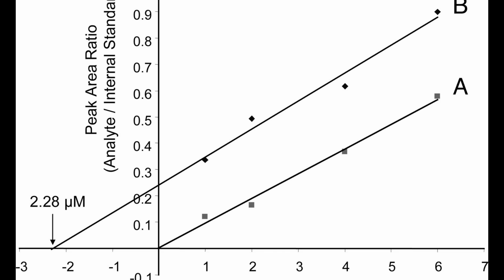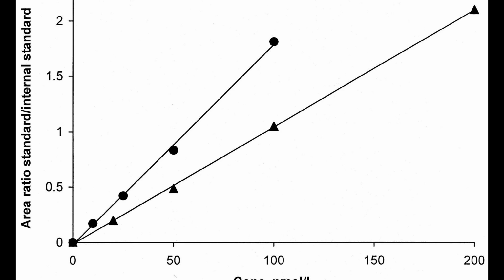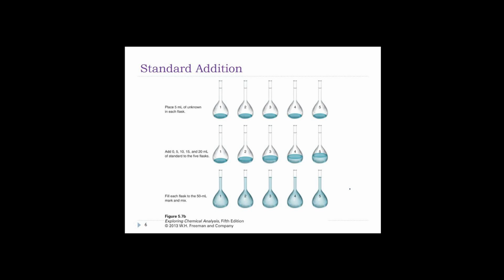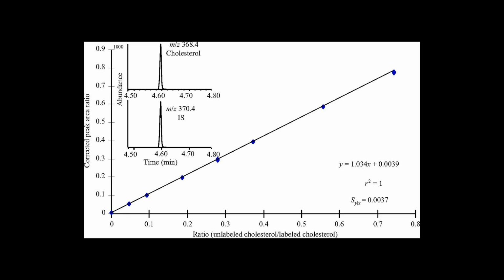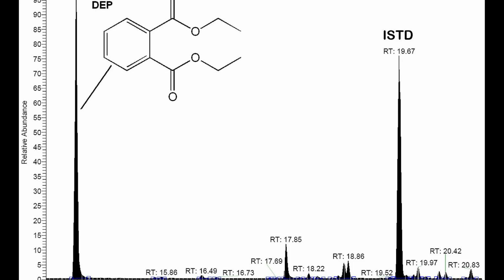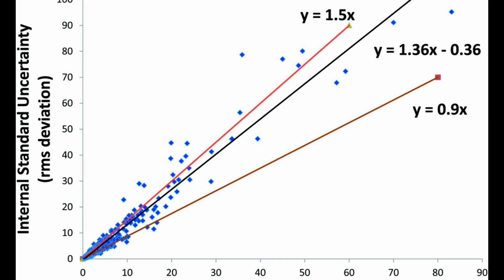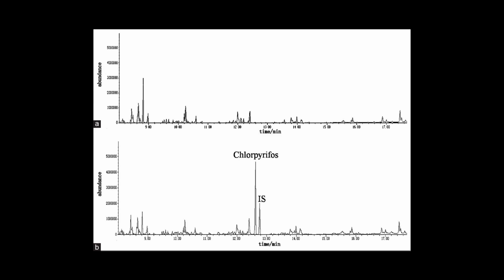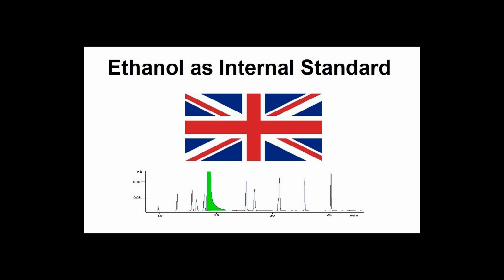The internal standard is a compound that is very similar but not identical to the chemical species of interest in the samples, as the effects of sample preparation should, relative to the amount of each species, be the same for the signal from the internal standard as for the signals from the species of interest in the ideal case. Adding known quantities of analytes of interest is a distinct technique called standard addition, which is performed to correct for matrix effects. This ratio for the samples is then used to obtain their analyte concentrations from a calibration curve.